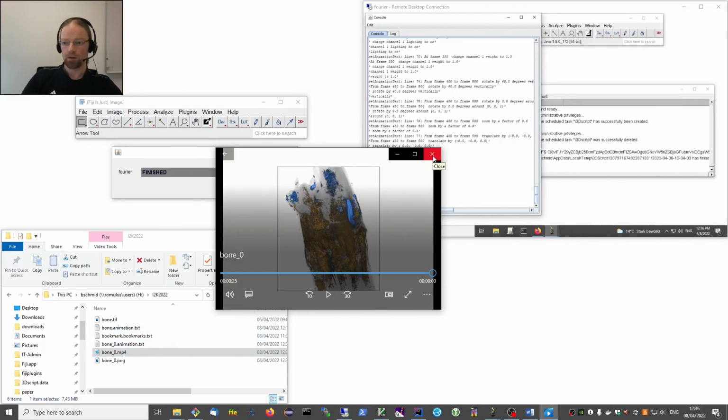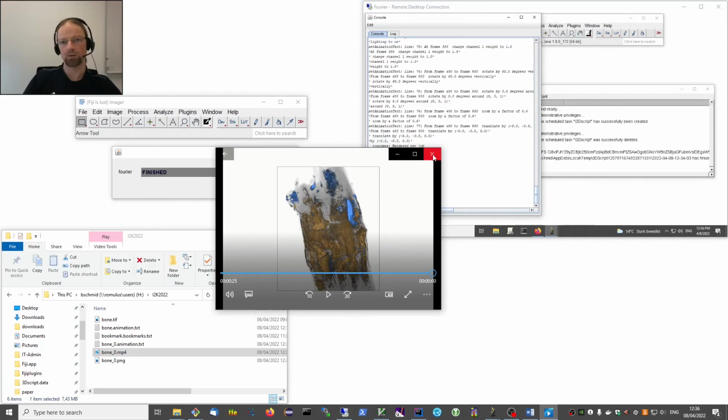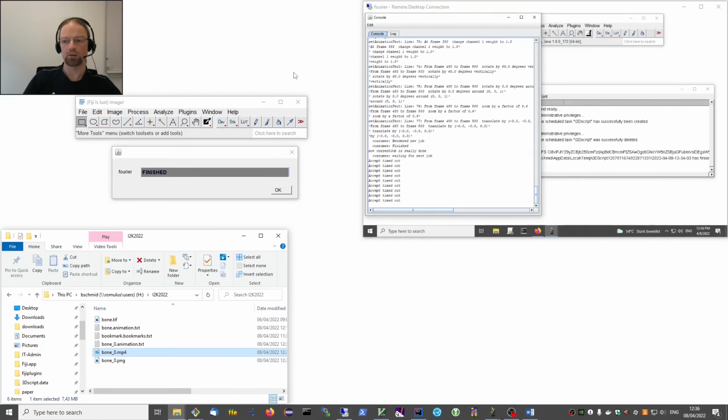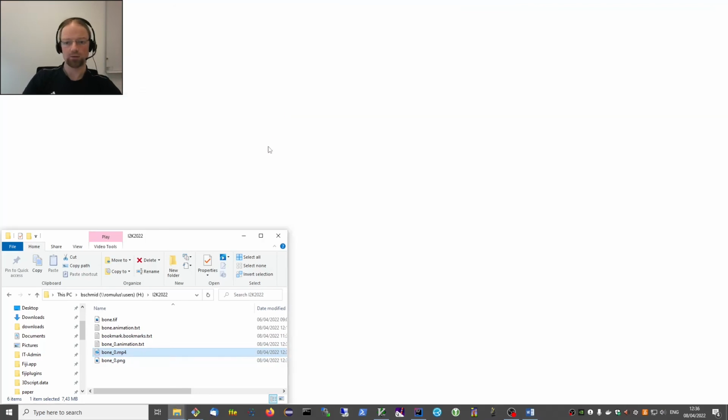Okay. So this is one client, but since we are running an OMERO server in our facility, I thought there must be a much more comfortable way to run 3Dscript on a dedicated machine. And this is OMERO 3Dscript, which I would like to show you now in the remaining time. So I will close my connection here. I will close also Fiji, we don't need it anymore right now.